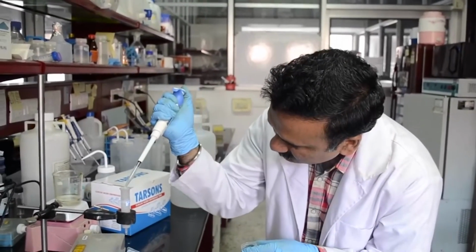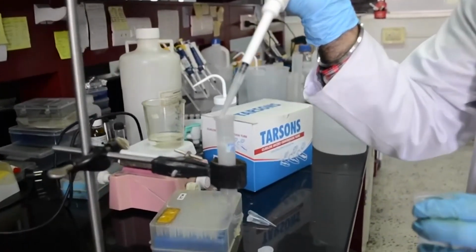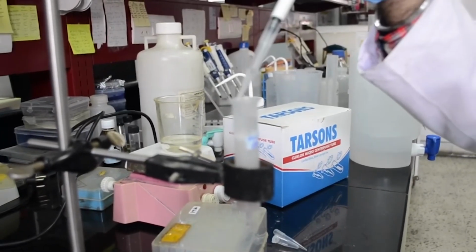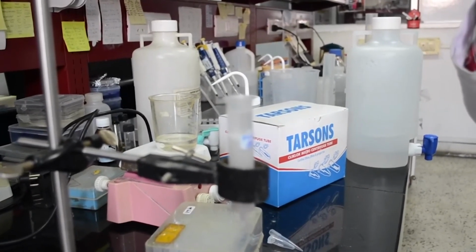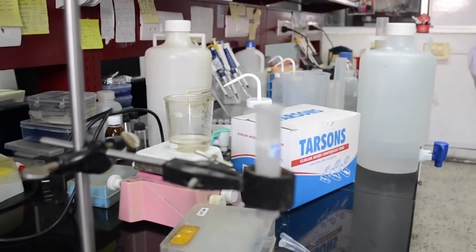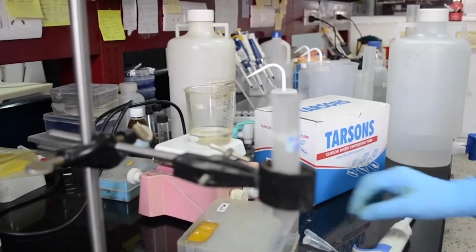Now it has reached this level, and you can simply fill the column with your water, fill it up to the top, and then start collecting the fractions.